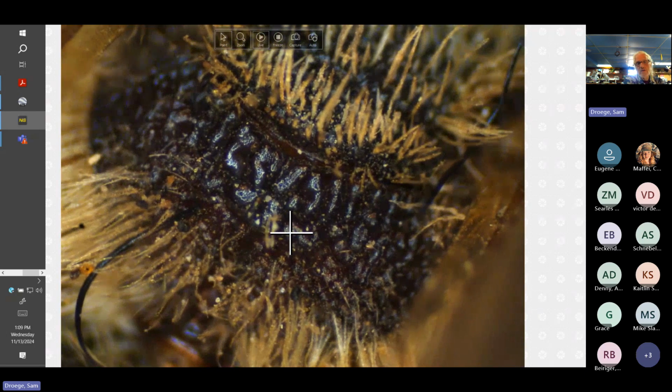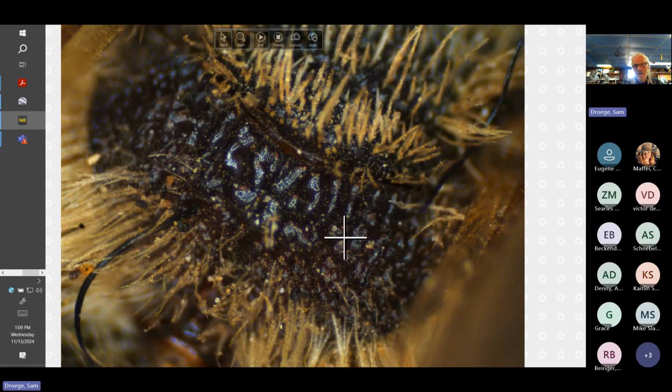And then within, so that's something to note, because many of the Trachandrena have a very clear boundary roughly here, that this surface area is quite different from this surface area. And here, it's not so much. In fact, just seeing the border between the two is really tough.